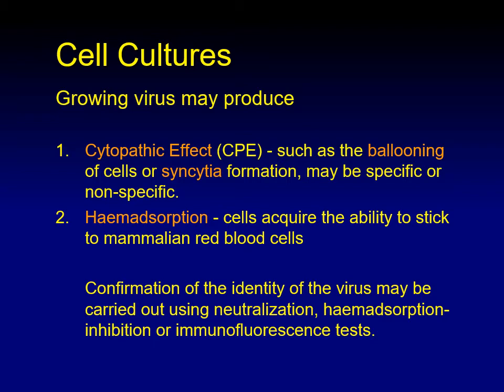Another type of cytopathic effect is what we call syncytium formation. Usually, within the cell lawn where the cells have grown, you will see very large, giant cells with multiple nuclei. The reason is that those viruses, when they infect a cell, do not leave the cell. They infect the next cell, which is attached to the infected cell, and the membrane starts to disappear between those cells, and therefore they form a very large cell with multiple nuclei. This is what I just mentioned, called syncytium formation.